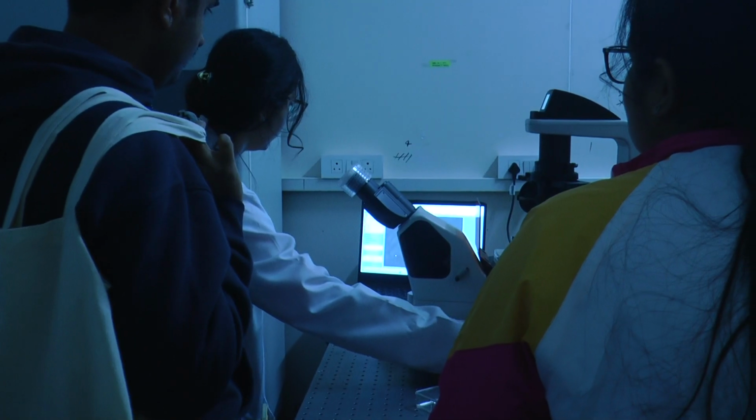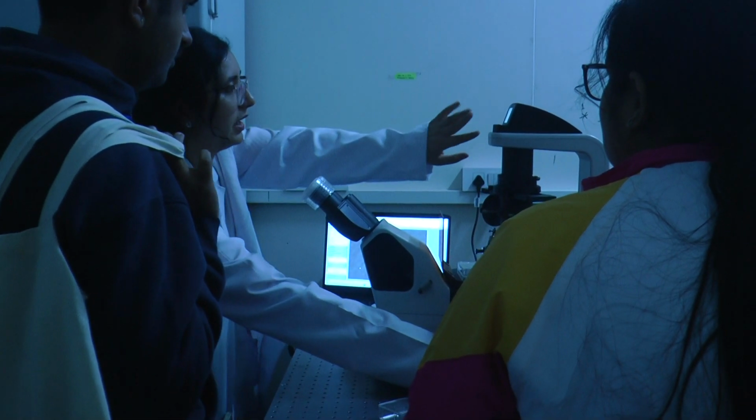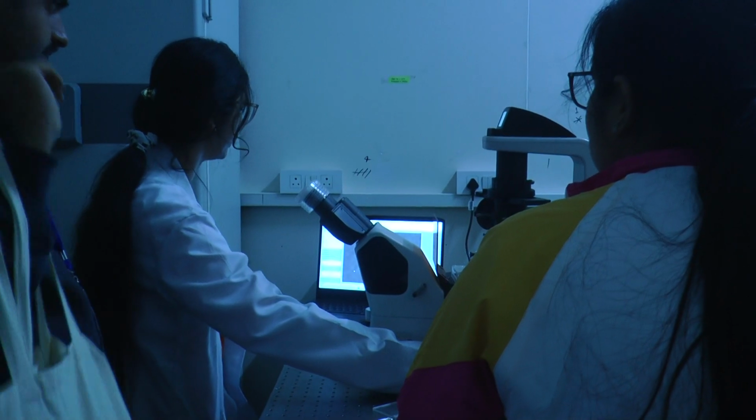Yeah. So magnification I have set to 40x. Now I'm changing focus.